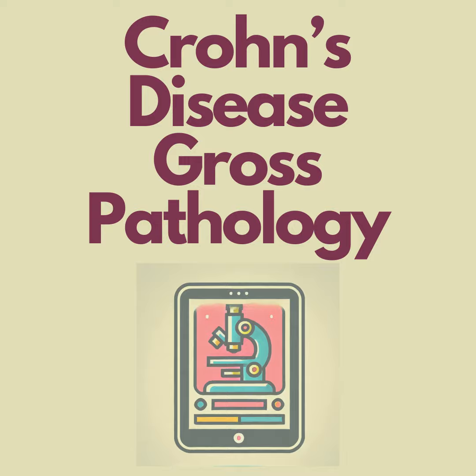What about the areas where the inflamed tissue transitions back to normal? Are those important to sample? Yes, definitely. We want to see what's happening at that interface between the diseased tissue and the healthy tissue. So even those seemingly normal areas can hold valuable clues.